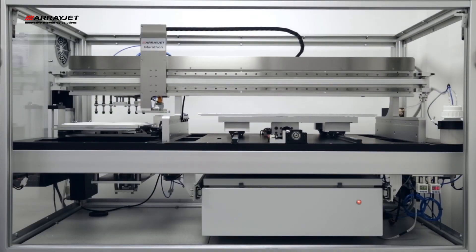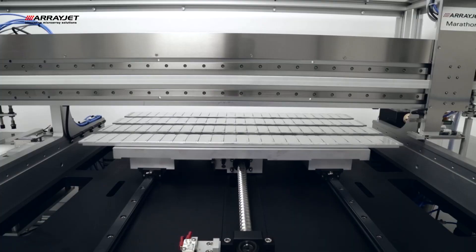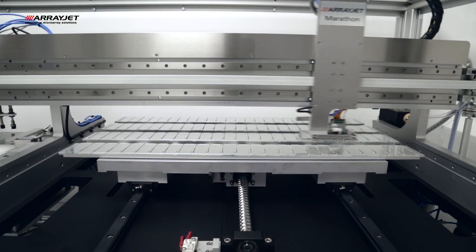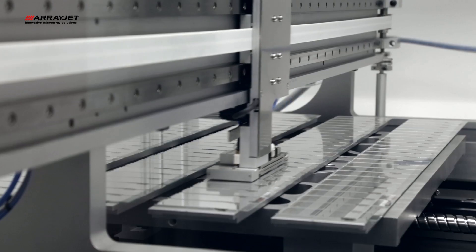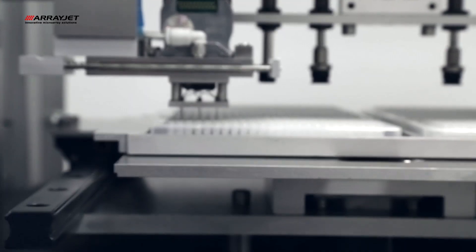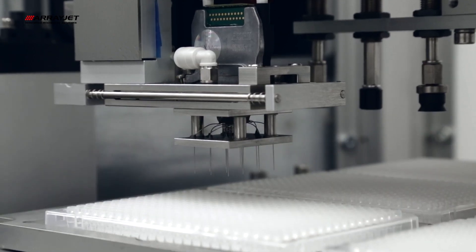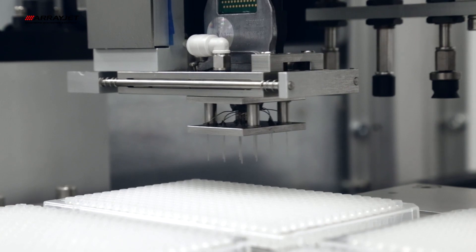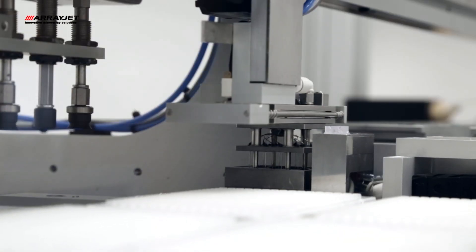The heart of ArrayJet technology is its non-contact inkjet printhead and jet spider sampler, which enables rapid printing cycles to be conducted in less than two minutes.